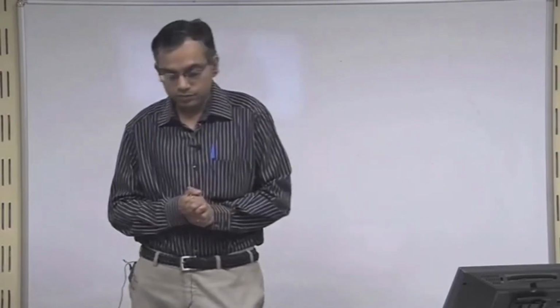Today we will start with a new topic, lab on a CD. The motivation behind studying this chapter is to talk about a microfluidic platform which is low cost and which can be used for many potential applications using medical diagnostics. So how does it look? Let me just try to show you essentially how the product looks like.